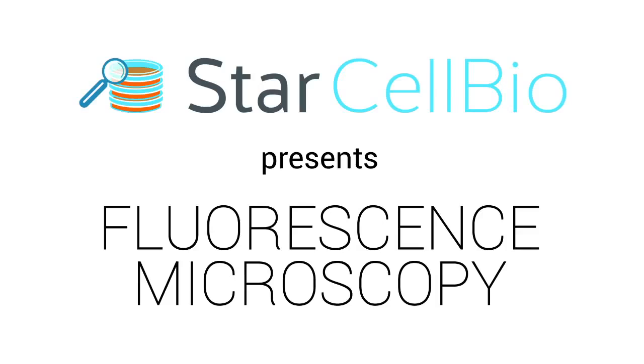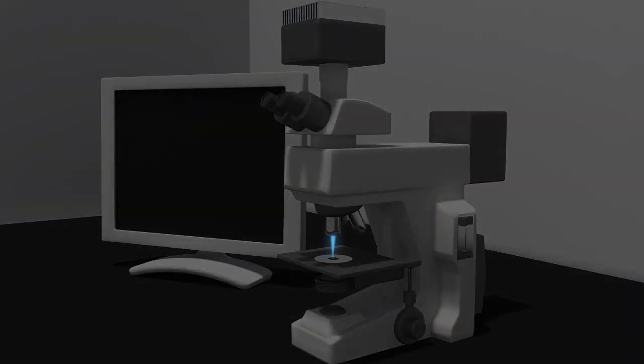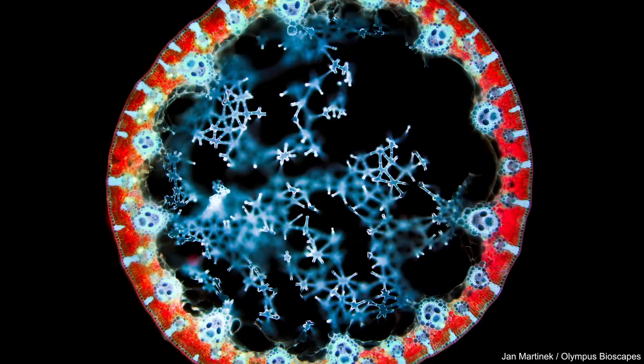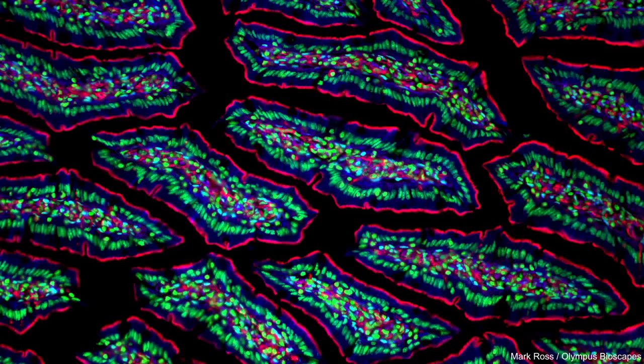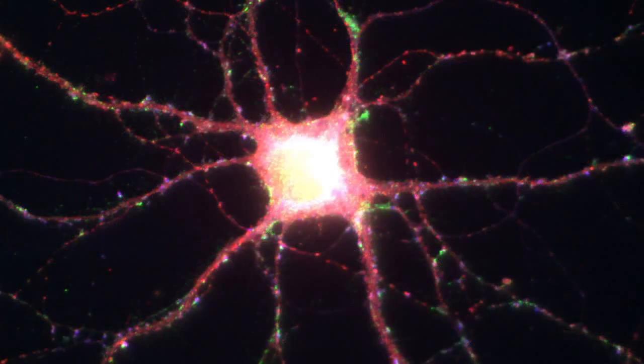In this animation, we will introduce you to fluorescence microscopy. Fluorescence microscopy is a special type of light microscopy in which the microscope uses a laser as the light source. A researcher will require the use of a fluorescent microscope to visualize autofluorescent cellular structures, fluorescent dyes or stains, or to analyze the expression, modification, and/or localization of proteins using fluorescent antibodies by a technique called immunofluorescence.